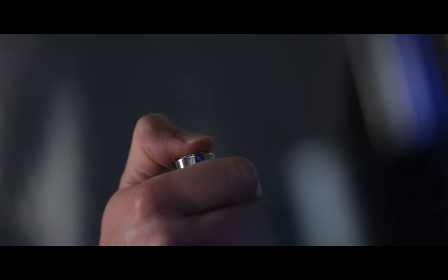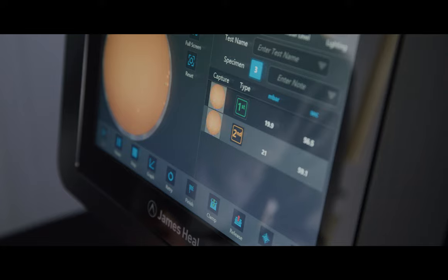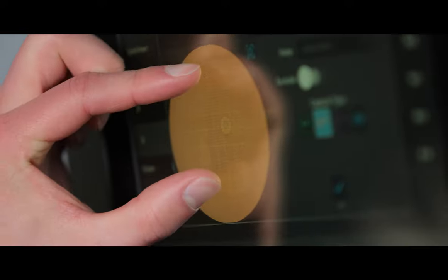An integrated camera captures an image when the user detects a drop. This supports live and post-test analysis and is further enhanced by the zoom and mark features.